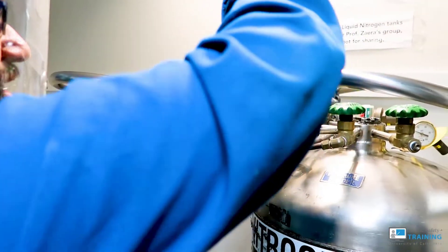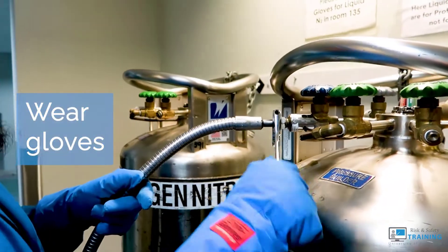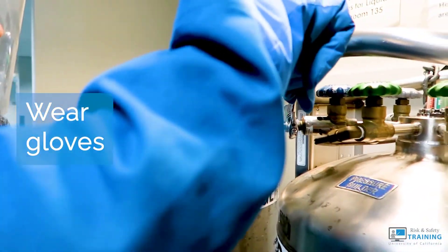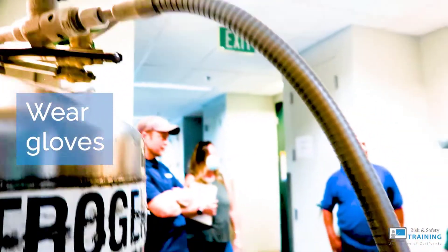Once you can't tighten anymore by hand, you'll need to use a wrench. Make sure you're using cryogenic gloves to protect your hands, because a metal wrench and the area around the valve will freeze and burn your fingers once the liquid is released.